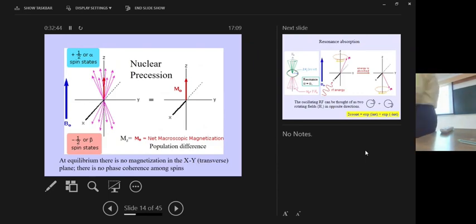What is the consequence of this? Now I take components of this on the z-axis, the x-axis, and the y-axis. Suppose these are nuclear magnetic moments; these are all nuclear magnets. I take components of that here, here, and also on the x-axis, for both here as well as there. But you see what happens in the xy plane. This is my xy plane. If I take a circle here in the xy plane, for every one orientation, there's an opposite orientation, because these are randomly spaced on the surface of the cone. And therefore, in the xy plane, there will be no net component. They will all cancel.